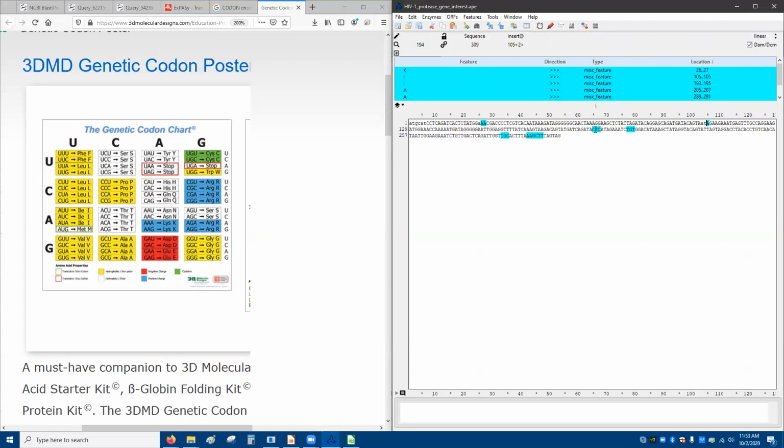Oh, yeah. One I here. CTC. Oh, so we just need to change the first A. And then we want A here. So look for A. Alanine, where are you? There you are. So GC anything. So change the first two to GC.